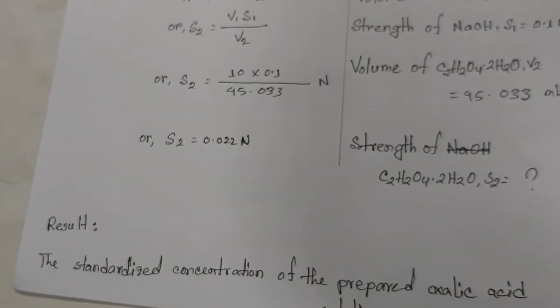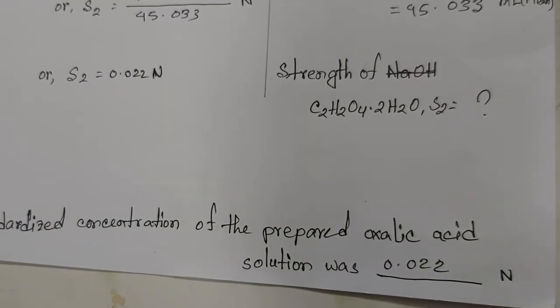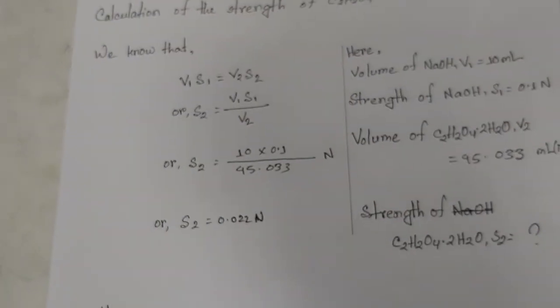That's the end of the titration. We have reached the endpoint. Since we obtained this endpoint by measuring the volume, this is known as volumetric analysis.